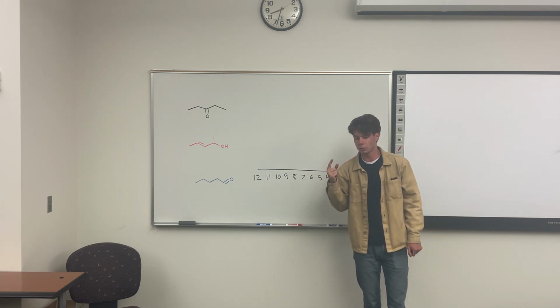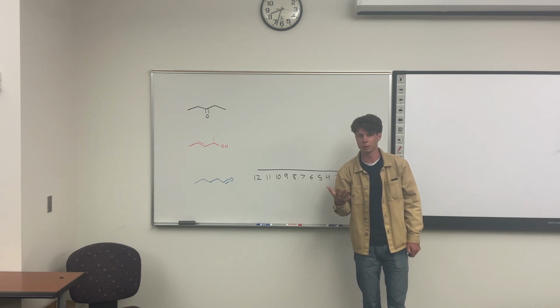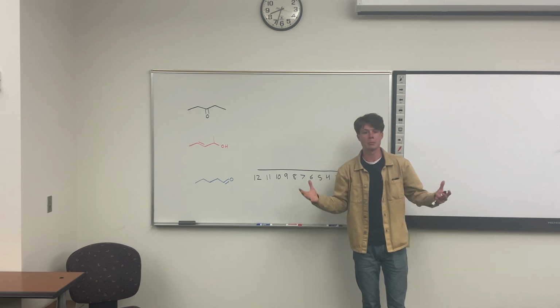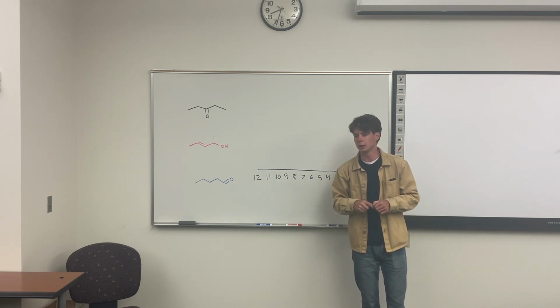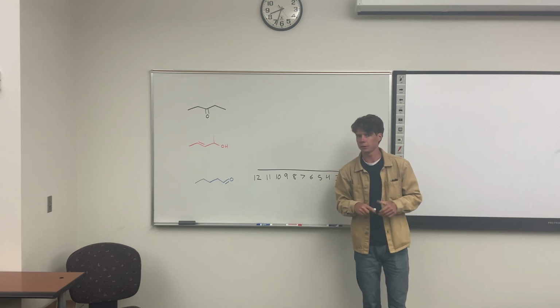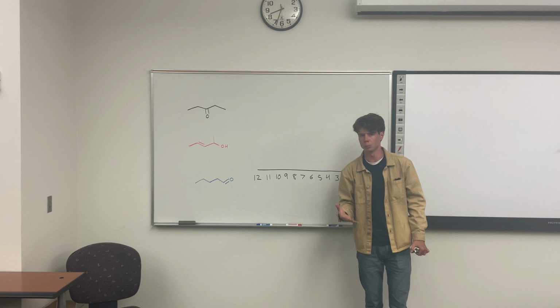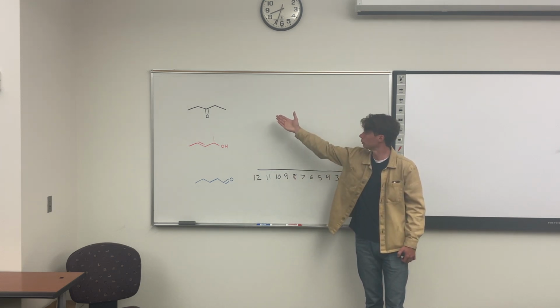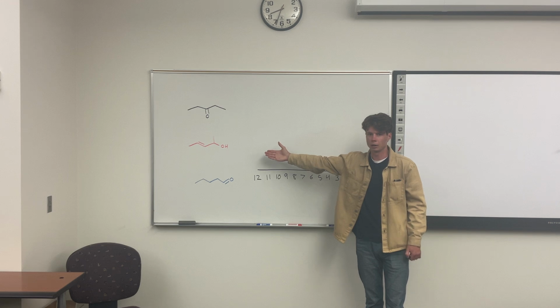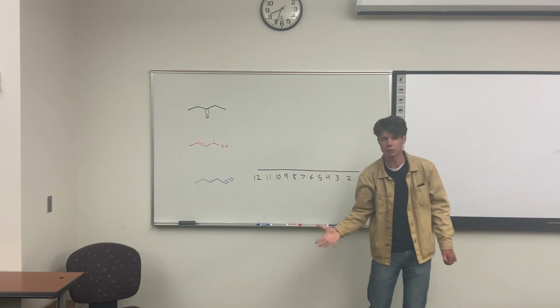them. So with that, there's probably going to be about 15 or 20 numbers you have to remember for a combination of both hydrogen and carbon spec. So there's probably Quizlets out there. I might just make one. It should only take a couple minutes for common functional groups like ketone, alkene and alcohol, and aldehyde, just for examples.